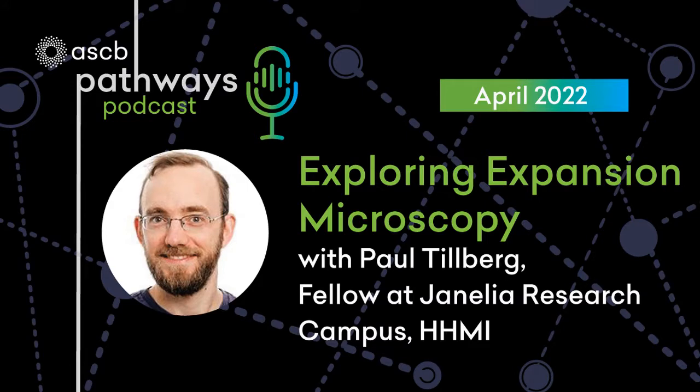The trade-off there is that the less crosslinker you have, the weaker the gel gets. So in fact, in the original ExM paper, we explored this a little bit by reducing the crosslinker and going up to a gel that expanded something like 8 or 9x. But the problem is that that gel was too weak to even stand up under its own force of gravity. That's like having very, very loose jello. Like your jello just didn't set up properly. Very loose. That's right. So if you take the water away that is floating in it, it doesn't even hold its shape. It's got this blobby jellyfish thing.